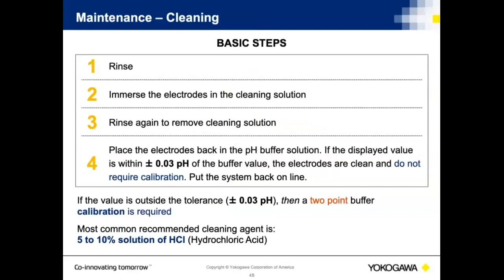Cleaning. Everyone over the years has asked me, well, how often do you clean your pH probes, Tim? How often should I maintain them? And I usually look at them, and I try not to be too sarcastic, to be honest, but I do say, I just don't know. You have to tell me about your process, and then you have to develop your own cleaning and calibration cycle.